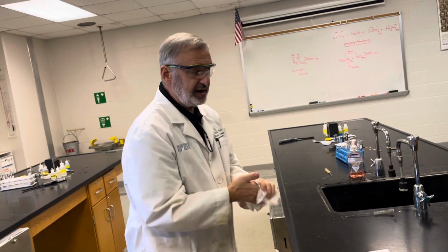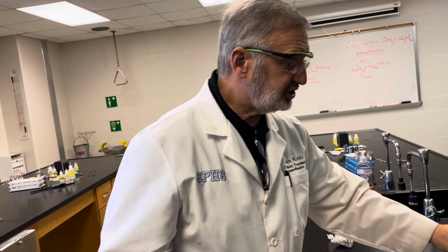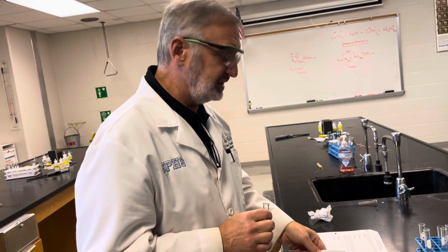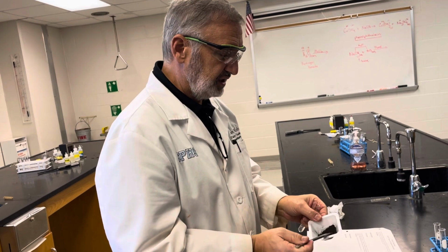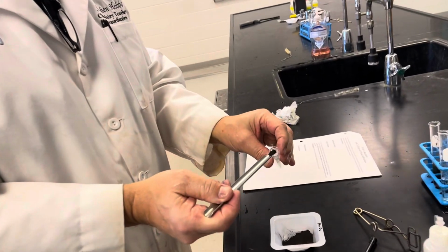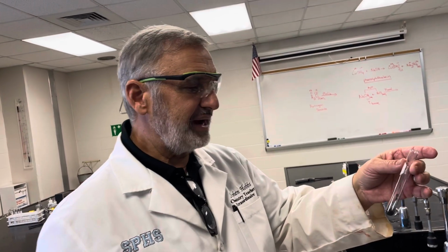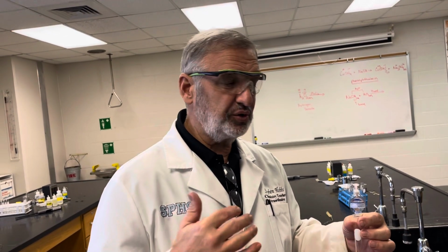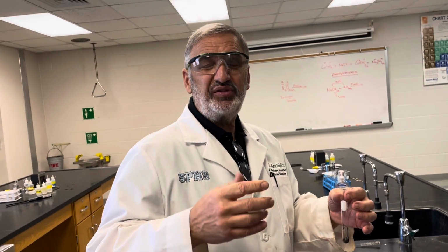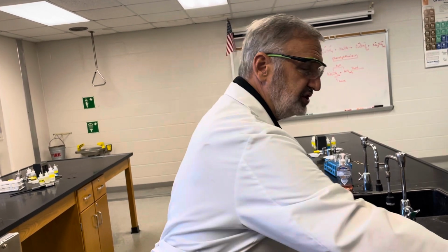All right, so the next reaction, reaction 5, we're going to take some manganese dioxide, but the actual proper name of this is manganese 4 oxide, because really you don't use prefixes with the ionic compounds. But we're just going to take some of this, and this manganese dioxide is going to be used as a catalyst for the reaction, okay? If you recall, a catalyst speeds up a reaction. It's not a reactant or a product. So think about, where would you put the catalyst MnO2 in your equation?